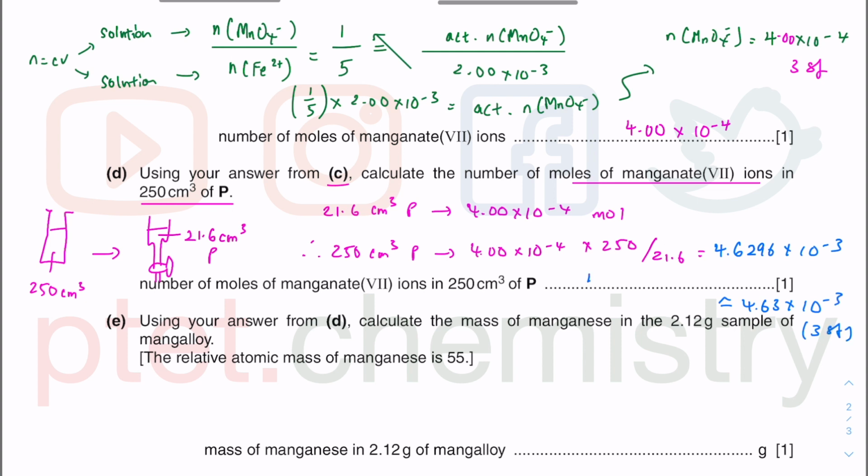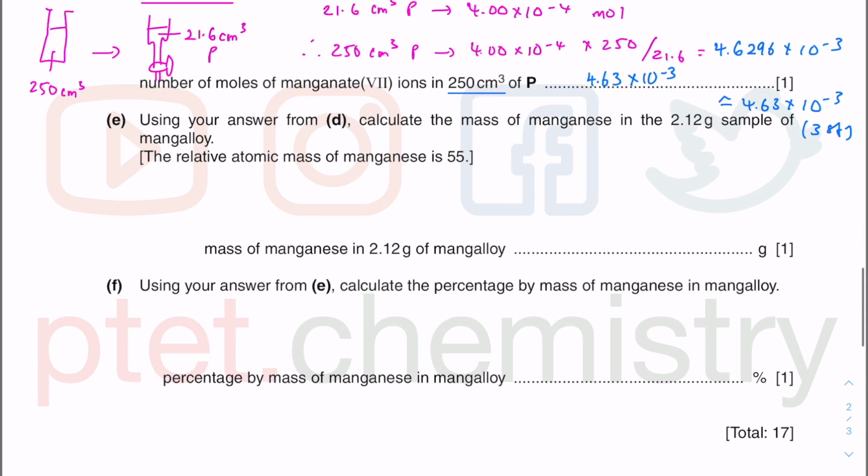That is actually the mole in the whole of that volumetric flask. The 250 cm cube was how you made up the solution up to in the volumetric flask. Not AS, but year 9 alternative to practical, year 9 mole calculation stoichiometry topic.